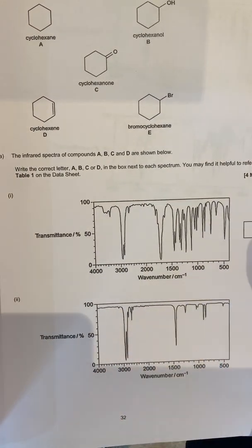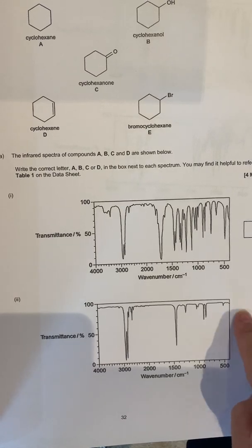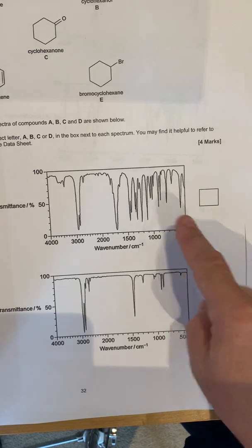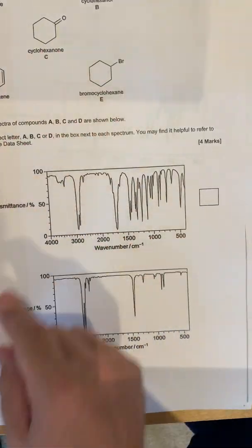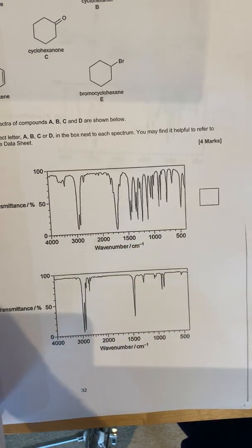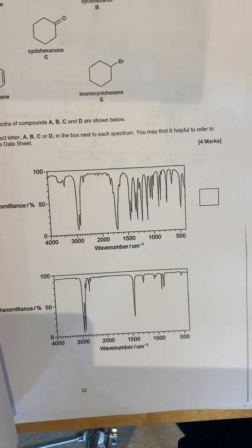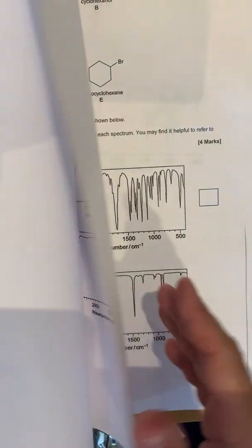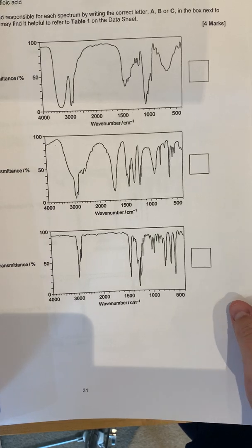So many times there should be a box there, on page 32, but you're identifying which of the molecules, the cyclic molecules, that those could be at the top. Remember, you're always looking for the functional groups, the unique groups, like an O to H, a C double bond C, C double bond O. Almost everything contains a CH.